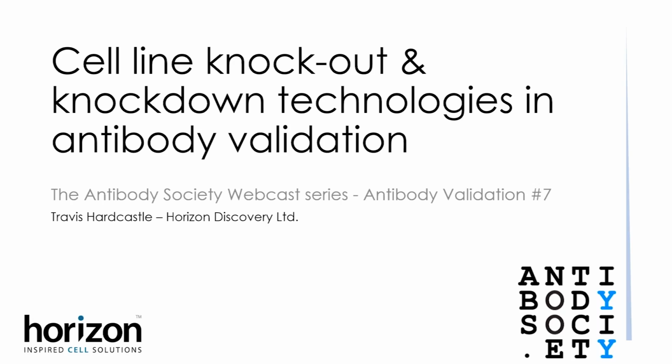It is a derivative of the KBM7 cell lines, and it only has one allele for most of the genes in the genome. And so what that really does is it allows us to really target that protein that we want without having to worry about compensation by a second allele or knocking out that second allele. And so it's really beneficial technology. That's super. Thank you very much indeed, Travis.